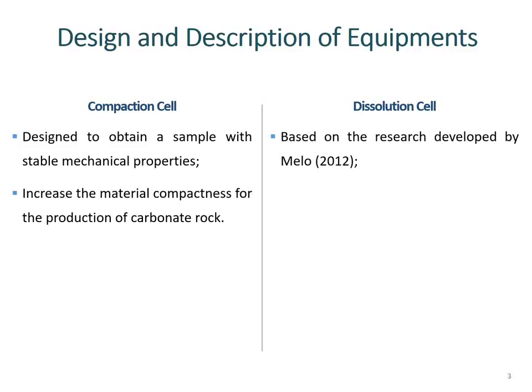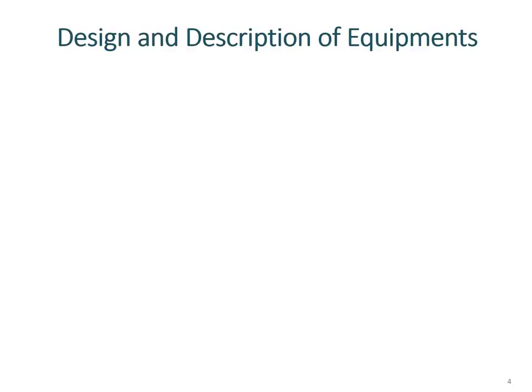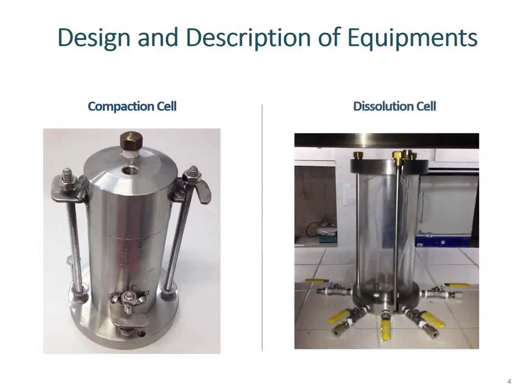The dissolution cell was based on the research developed by Melo, also from Federal University of Pernambuco. A new cell was built for the purpose of this research, and a synthetic carbonate rock with smaller volume was made than the one seen in research by Melo. Here it's possible to observe the compaction and the dissolution cells used in my research.